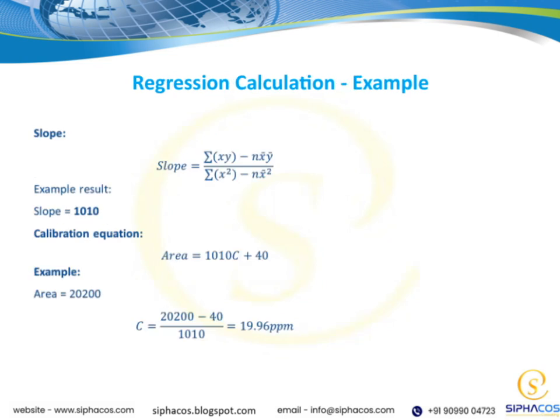Let's walk through a practical example of how regression calculation works. On this slide, you'll see an example that illustrates the key steps involved.